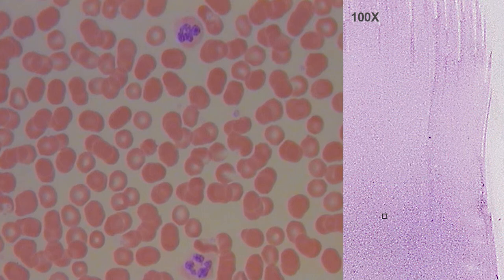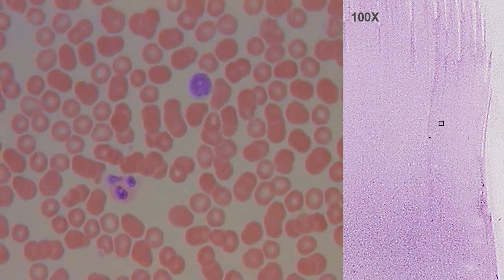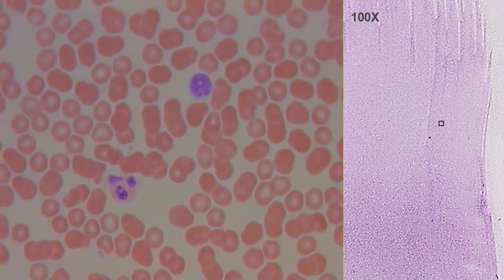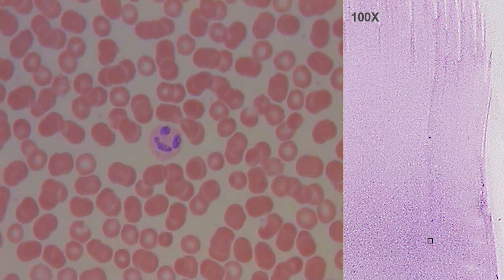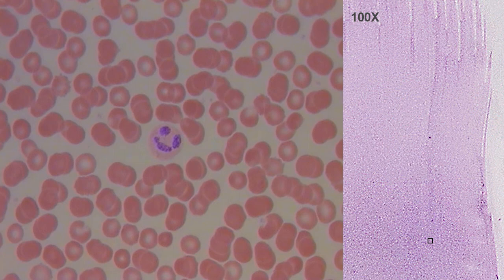With the 100-fold magnification objective, the previously described cellular types can be observed in more detail.